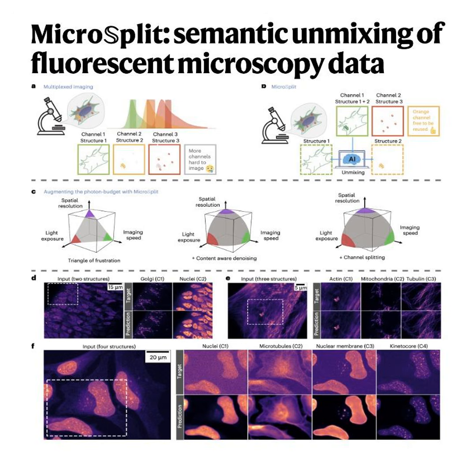Right. And to prove that you can trust the areas where the AI is confident, they ran a graded evidence test. So they brought in 3 top human analysts to manually segment the images, right? Yes, and then they compared the human-to-human disagreement against the AI's predictions. And the validation there was pretty definitive.